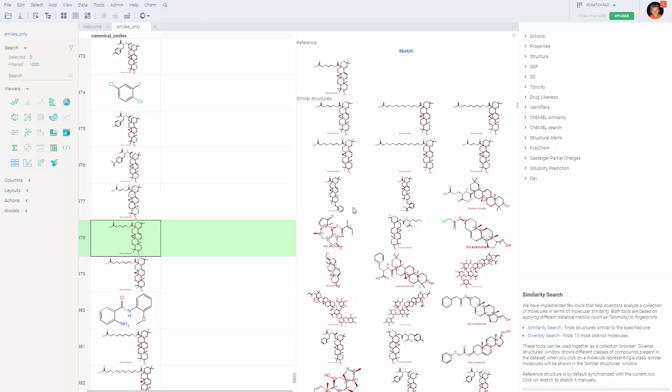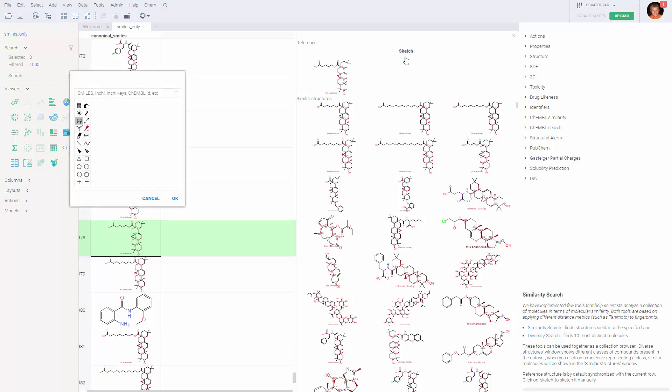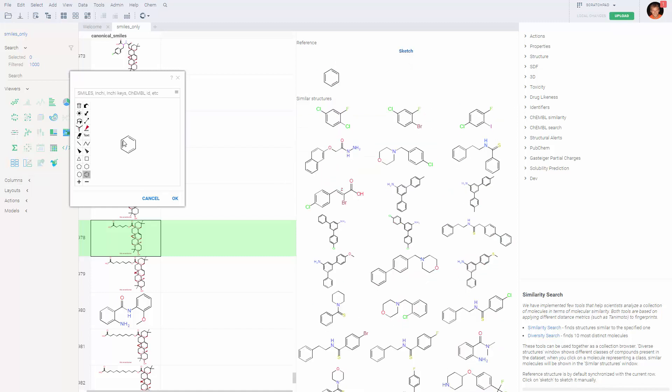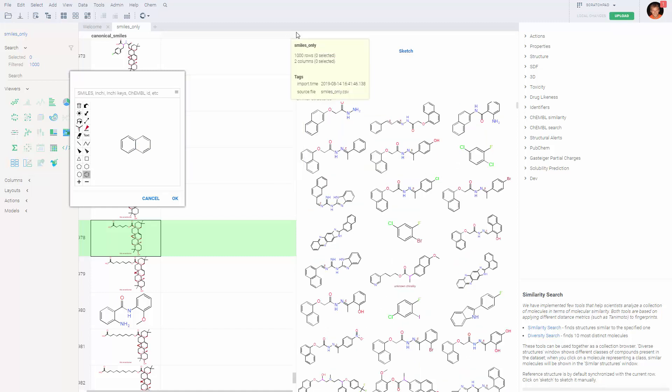Another way to change the reference molecule is to sketch it. Just click on sketch, start drawing your molecules and similar molecules appear automatically.